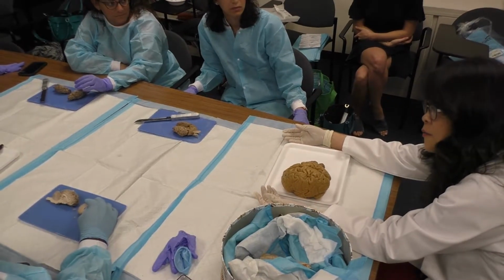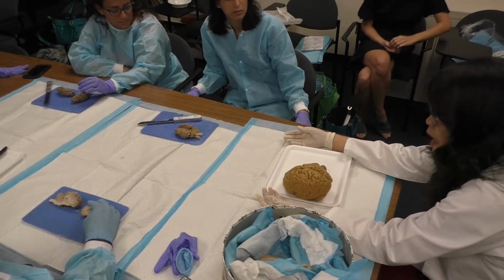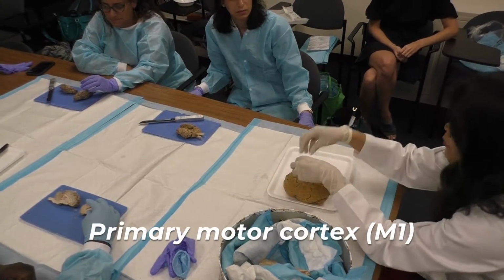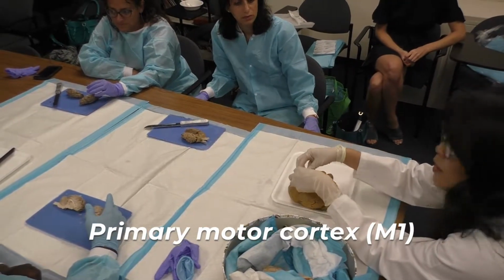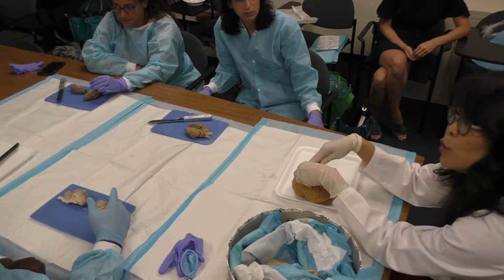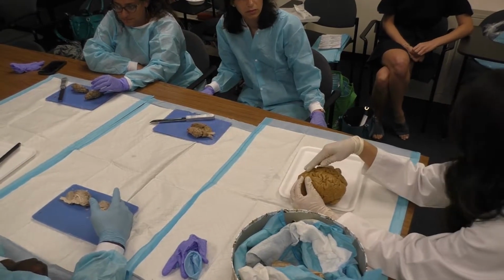So there's lots of brain areas that are helping us control motor function. We talked about the cerebellum. Primary motor cortex is right up here. That's obviously critical. You have damage to this area and you're not able to move your body voluntarily anymore.